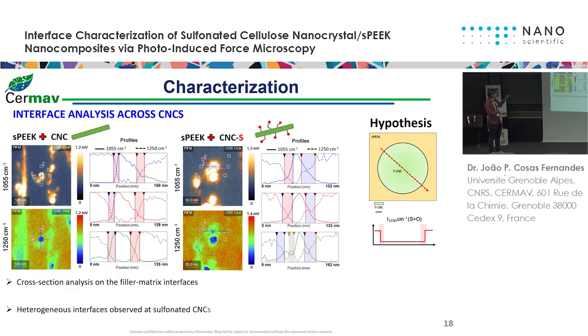And what we see here is rather a sharp interface. So if I go from the sPEEK and I pass through the CNCs, I have this sharp transition.